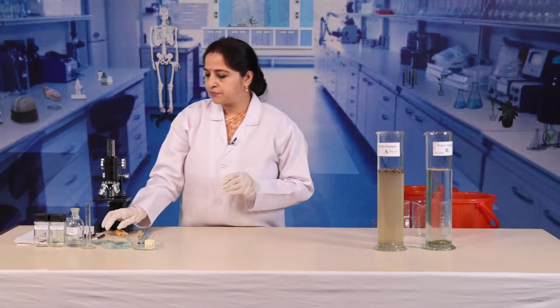Add about 5 ml of FAA to each sample in order to fix and preserve the organisms present in the collected samples.